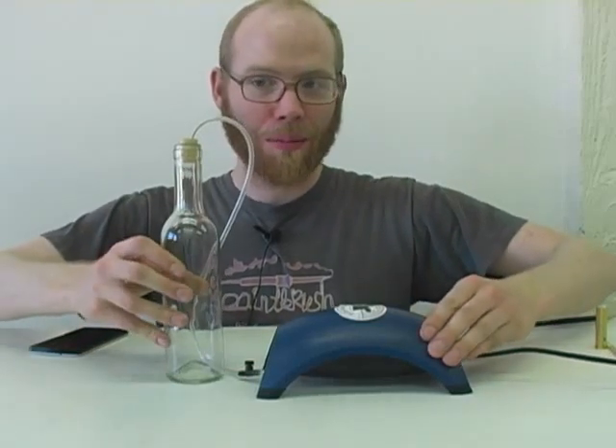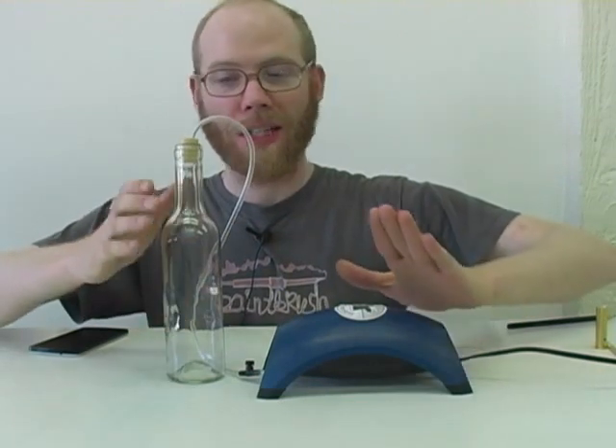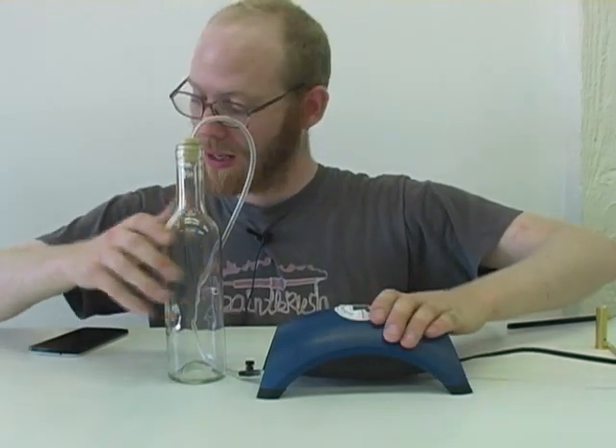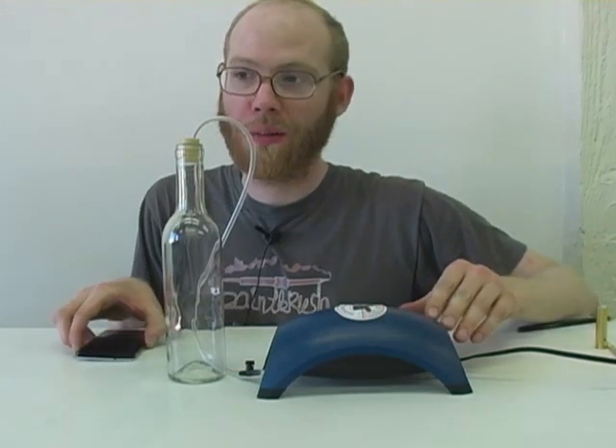So with our calibrated air pump, we can now run formaldehyde tests. We're going to have to keep the pump running for 30 minutes. I have a timer running on my cell phone — I set a 29-minute timer instead of a 30-minute one so that I'd have a minute to shut off the system.